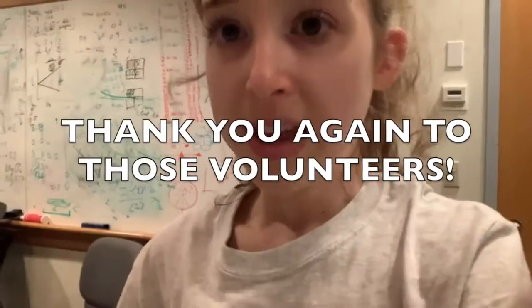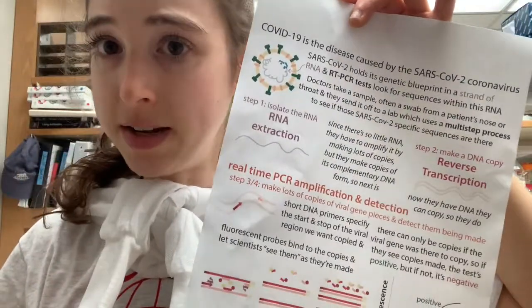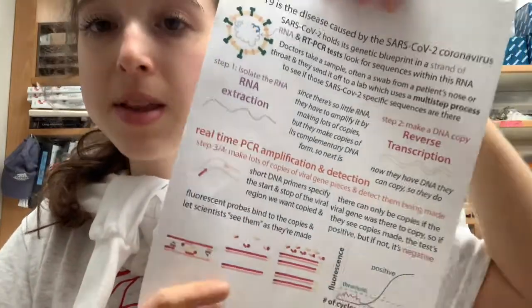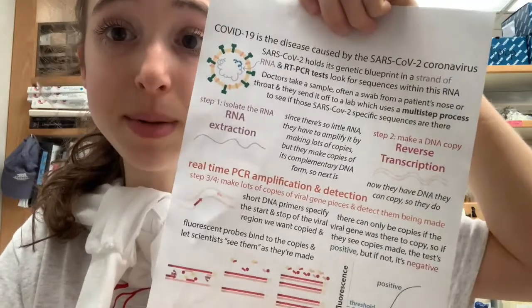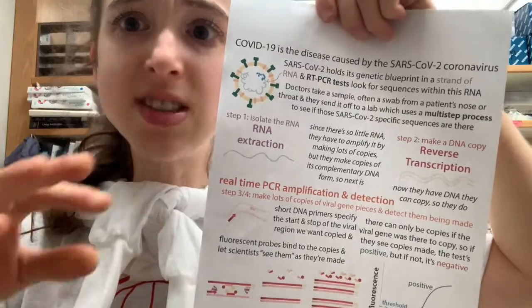And so in the spirit of this international collaboration, in honor of the International Olympics, although here we're all on the same team, I thought I'd do a video explaining how these tests work. I'm going to start with a basic overview of the process, and then I'll go into more details later. So if some of these terms seem unfamiliar, don't worry, we'll go into more details. But the basic idea of this RT-PCR test, RT-PCR stands for Reverse Transcription Polymerase Chain Reaction, and we'll get to all of those things.